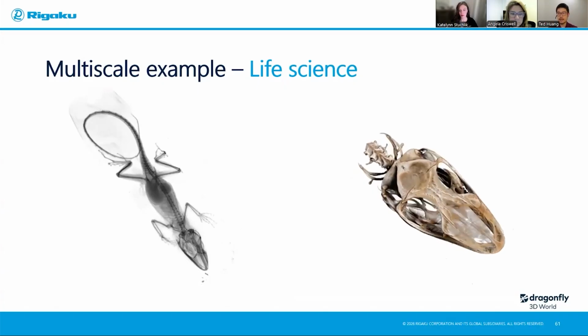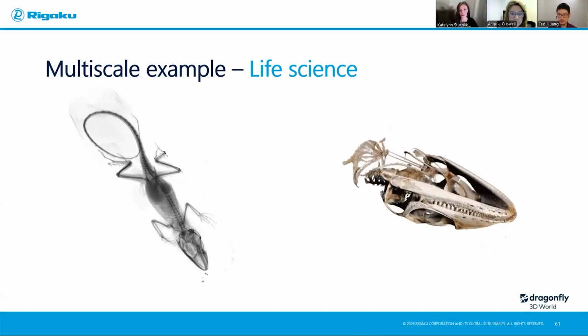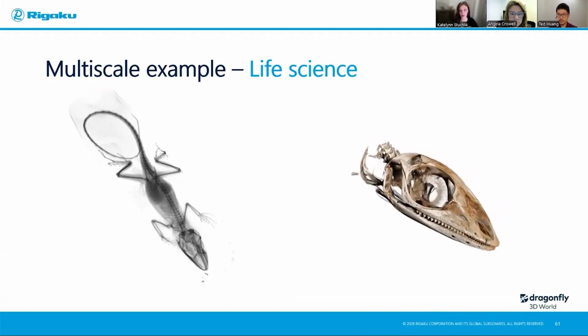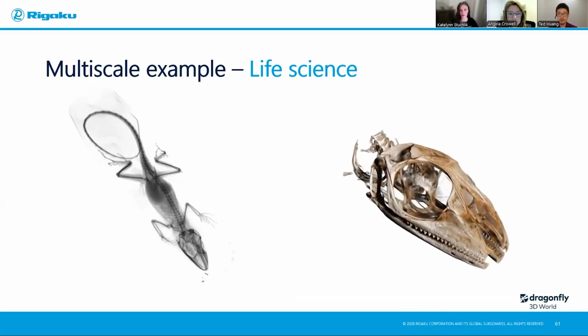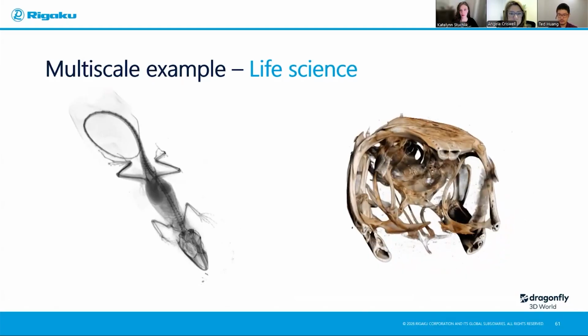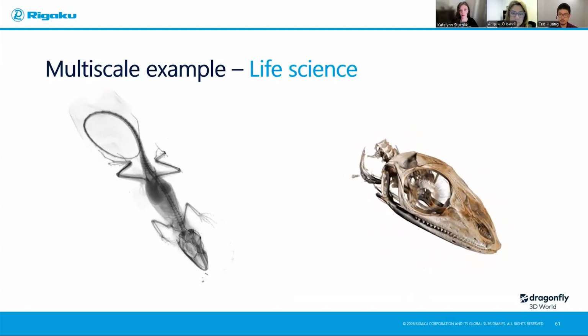So we did a high resolution scan on the same lizard you see on the right, and with high resolution, you can even count the teeth and look at the shape of the teeth. Those are the features of interest they want for the study, to basically separate different species and quantify the difference in different lizards they collected from different areas.